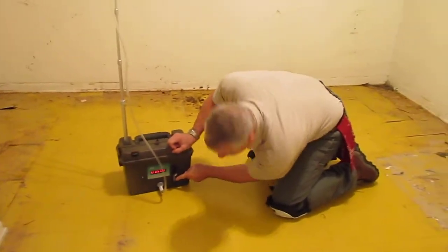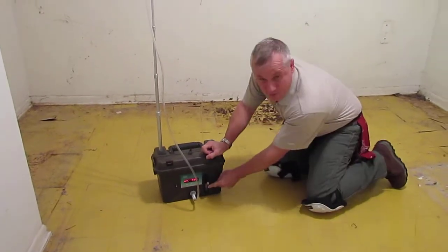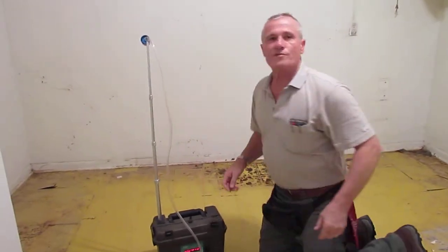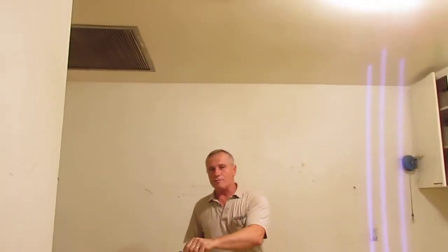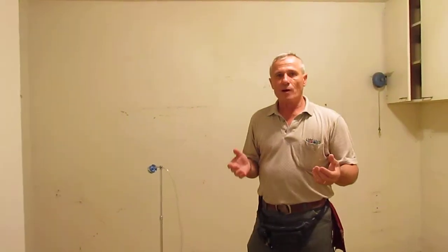And then we set it for five liters. The little ball is at five liters. So now we just run this for five minutes and all the air that is returning through the house, which is the air return, will be captured inside this cassette. That's what the lab analyzes and comes back with a spore count — how many spores per cubic meter, and what kind of mold spores. Thank you.